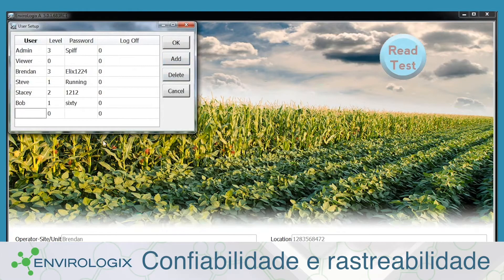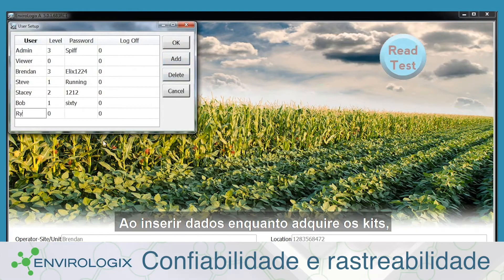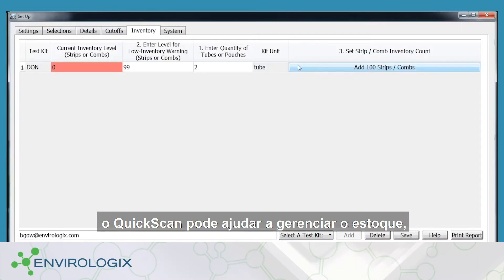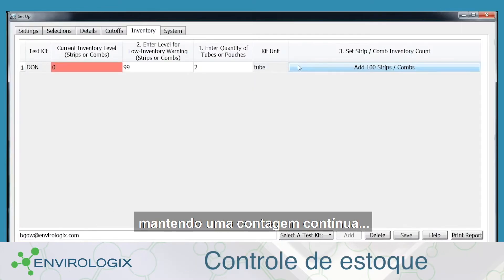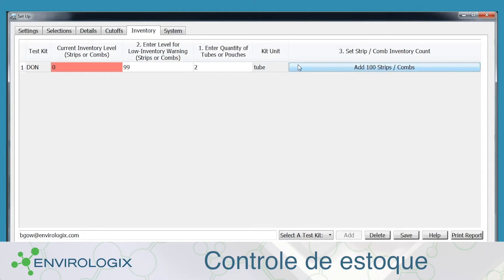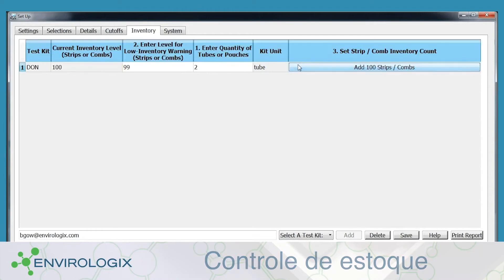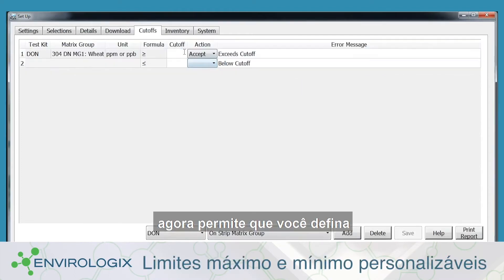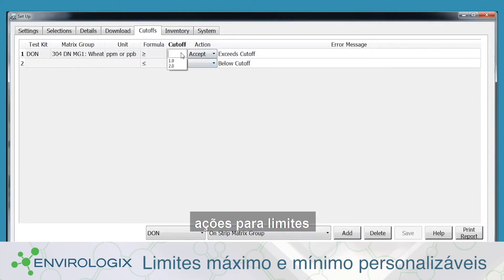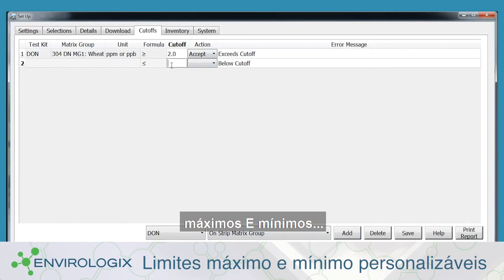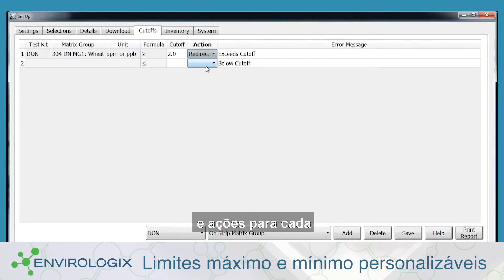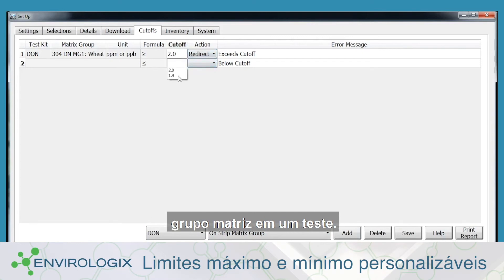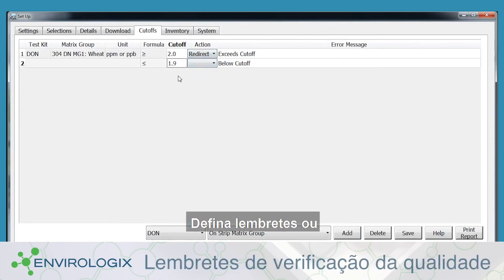By entering data when you purchase kits, QuickScan can help manage inventory, keeping a running count and reminding you to order more. The cutoffs function allows you to set actions for both upper and lower limits, and you can now customize limits and actions for each matrix group within a test set.